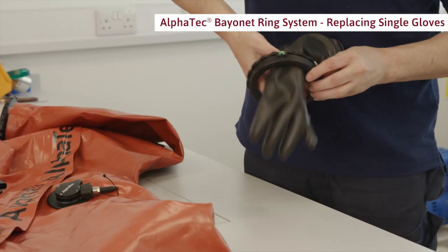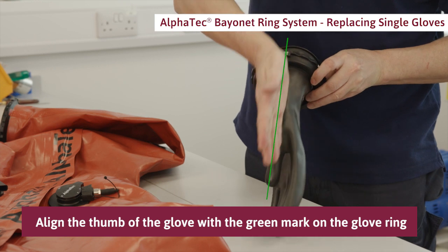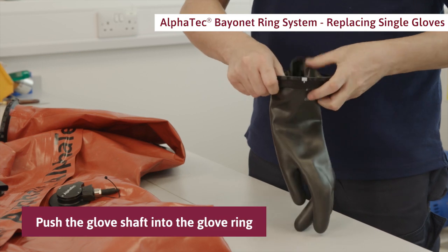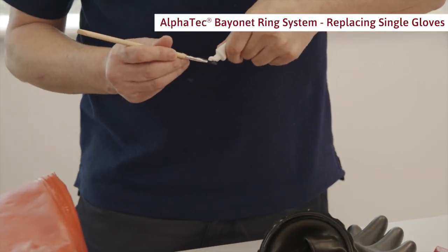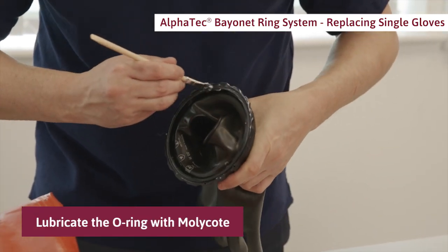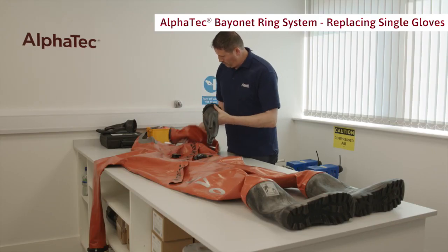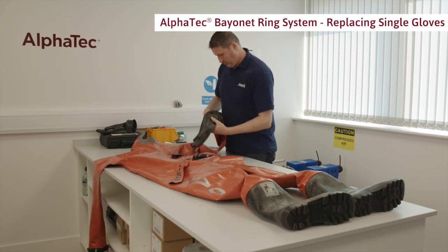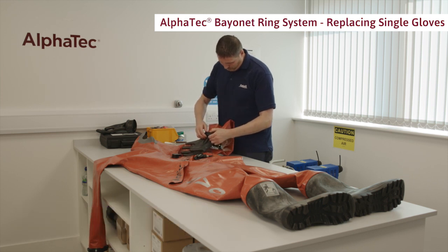Take a new rubber glove and place the black inner ring into the shaft. Push the glove and ring set through the glove ring and align the thumb of the glove with the green mark on the glove ring. Push it firmly into place using your thumbs. Fold the glove shaft into the glove ring. Lubricate the O-ring with Moly Coat using a brush or your finger.